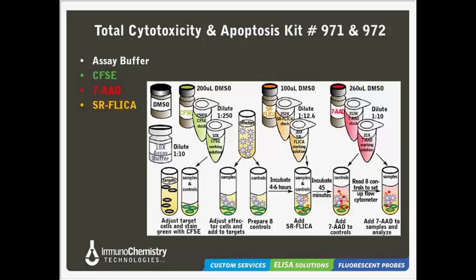If the cell does not have active caspases, SR-FLICA will simply wash out of the cell. It is not actually cleaved by the caspase. Instead, it will form a covalent bond with the caspase reactive sites, which renders that particular caspase enzyme inactive, and it can no longer cleave any substrates. Bound SR-FLICA will remain inside the apoptotic cells, and unlike antibodies, SR-FLICA will not react with procaspases nor inactive forms of the enzymes. Finally, add 7AAD to stain necrotic cells red.